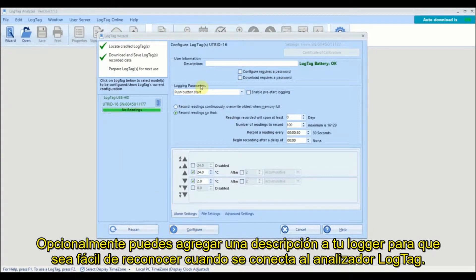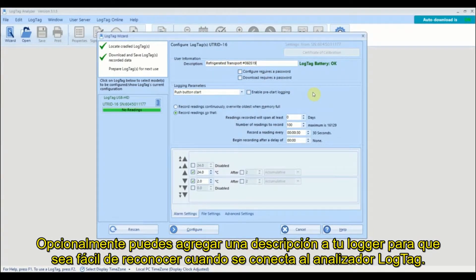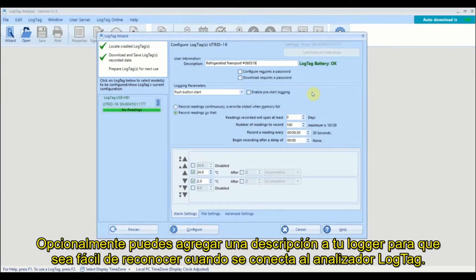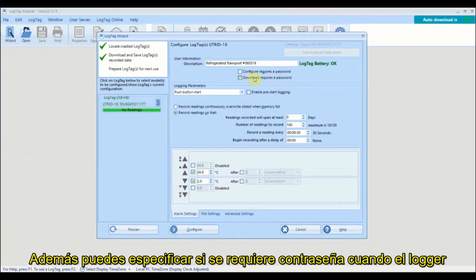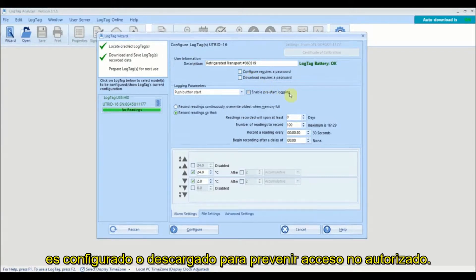Optionally you can provide a description for your logger so it is easy to identify when the logger is next connected to LogTag Analyzer. You can also specify whether a password is required when the logger is next configured or downloaded to prevent unauthorized access.